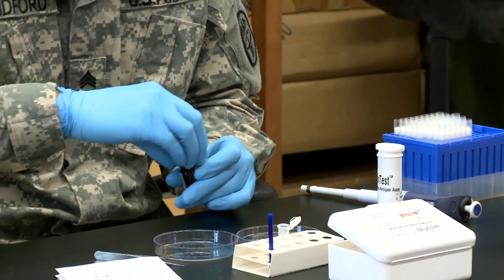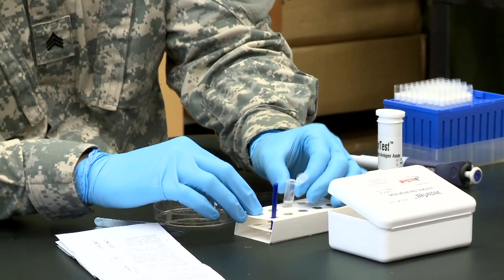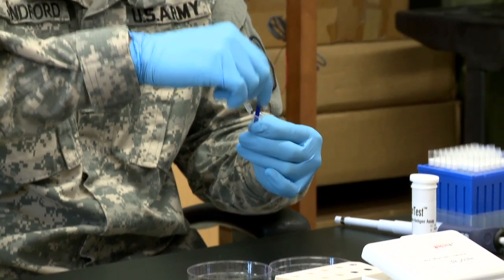Place the pestle provided in the kit into the grinding tube and vigorously rotate it to homogenize the sandflies. The pestle can be reused if washed between uses.